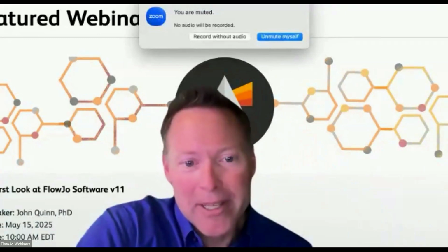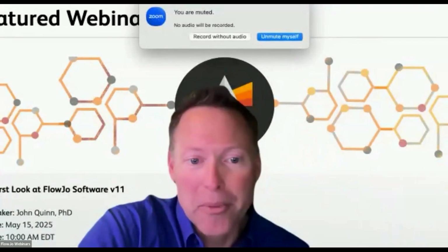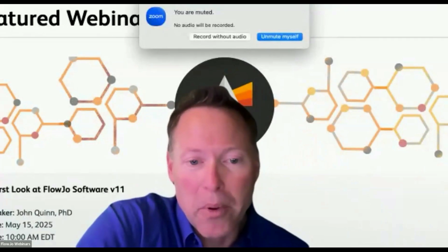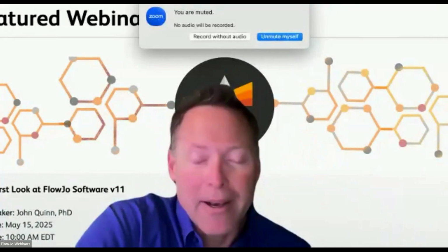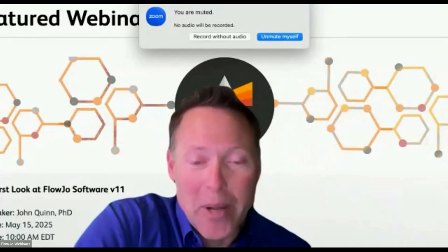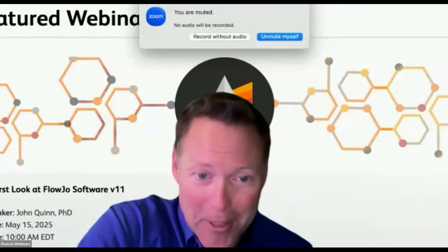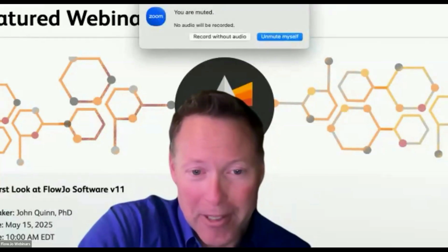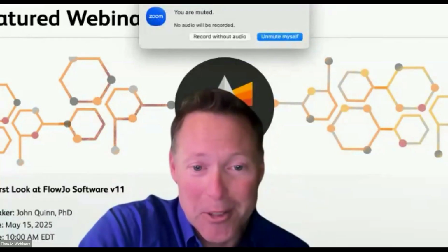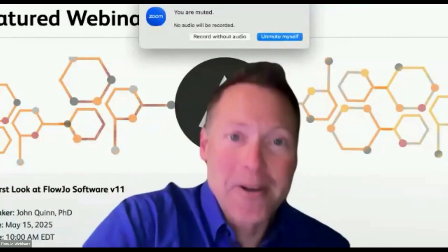But for anyone who's joined today, I just want to open up the software and show you how it works, show you the primary components, and talk a little bit about what we were thinking when we designed it. I know there is great fear that a new version will look way, way different, and it does look way, way different. I will make the claim that if you've ever used FlowJo before and you just start doing what you expect to do, it will do what you expect to do. Fingers crossed. Let's talk about it.